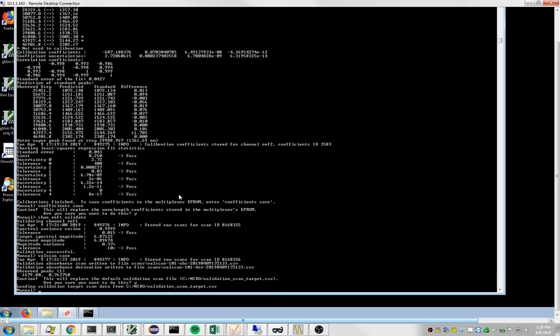Okay, that's it. We have recalibrated all channels on the analyzer. We've validated the coefficients. We've produced a new validation scan for future use, and we are finished.